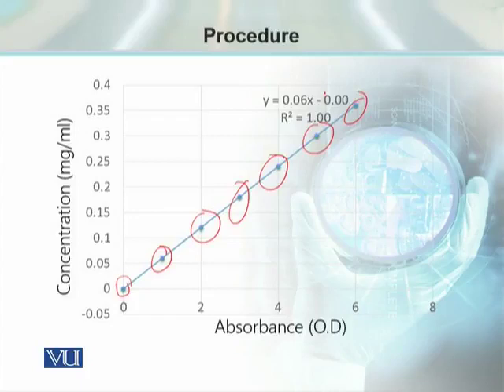Regression line can easily be drawn using the Excel software. For that regression line, if the concentration is best, if the optical density is okay, and there is no error because of the spectrophotometer or because of any contamination, any unwanted material in the tubes, then you get the best fitted line. And how good the fit is can be seen by the value of r square.